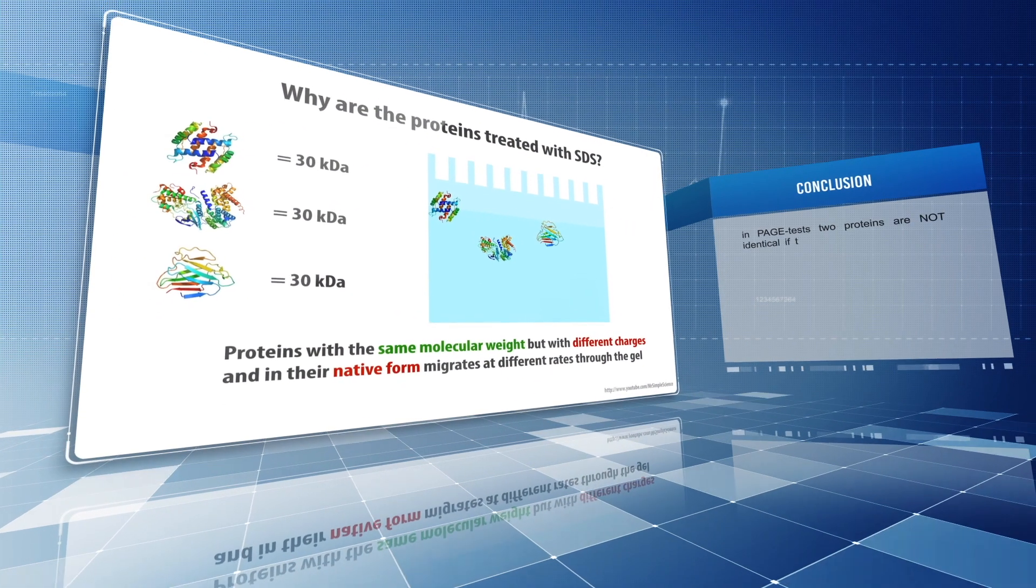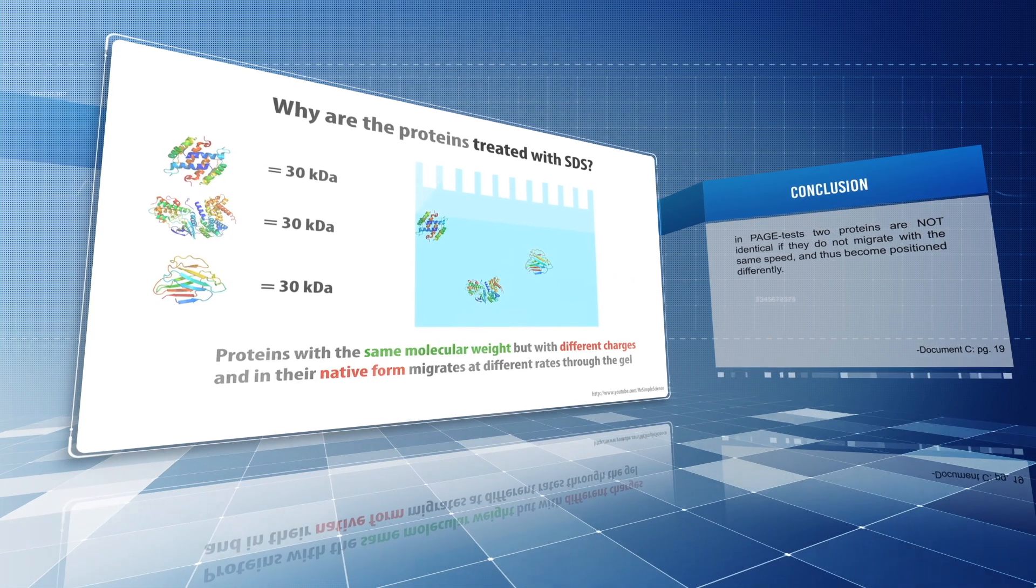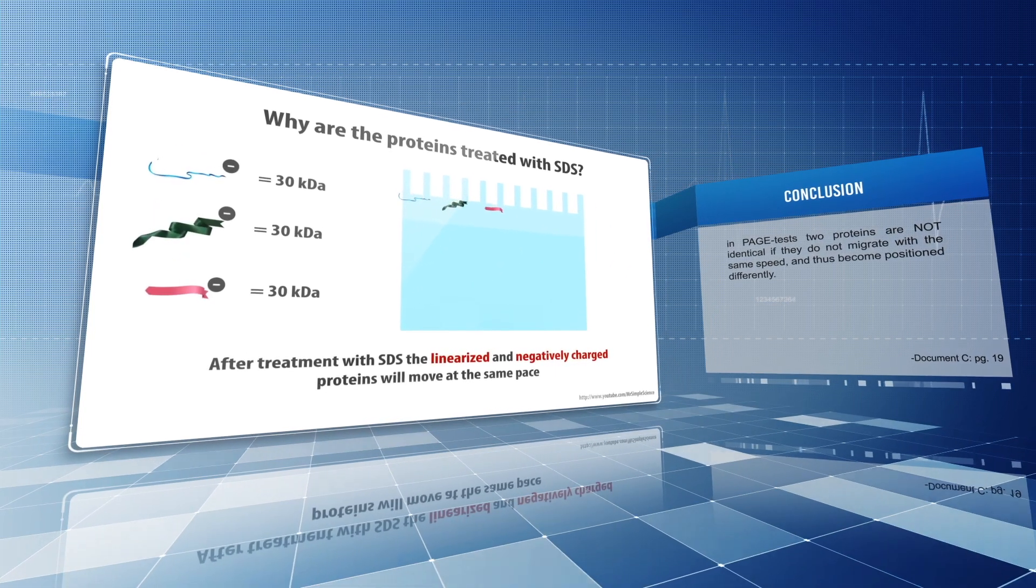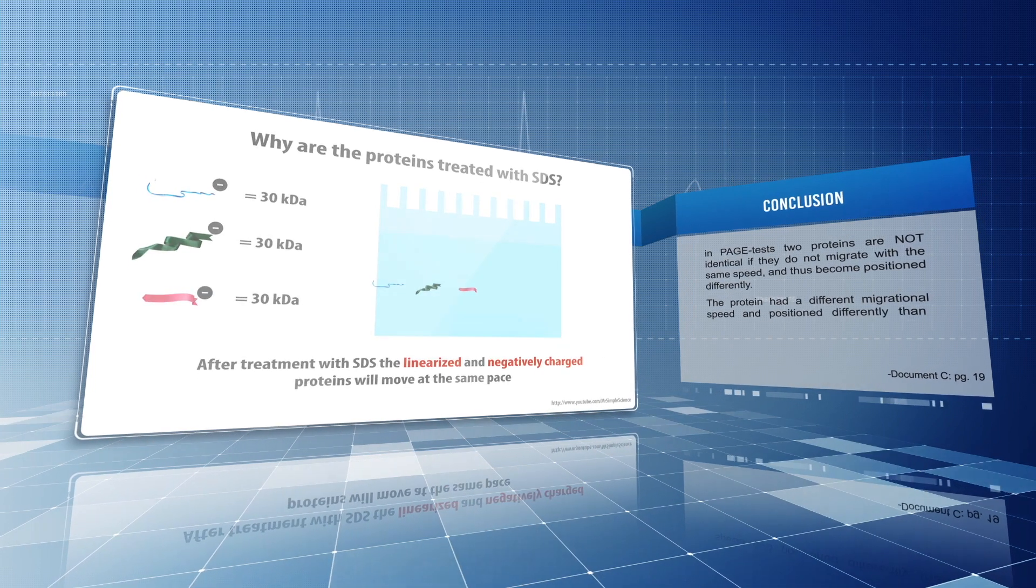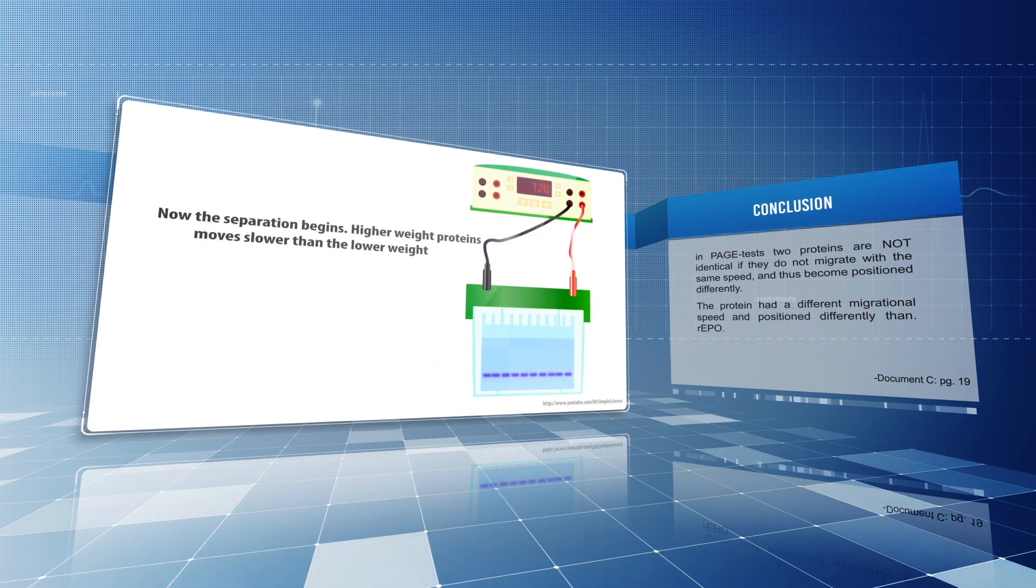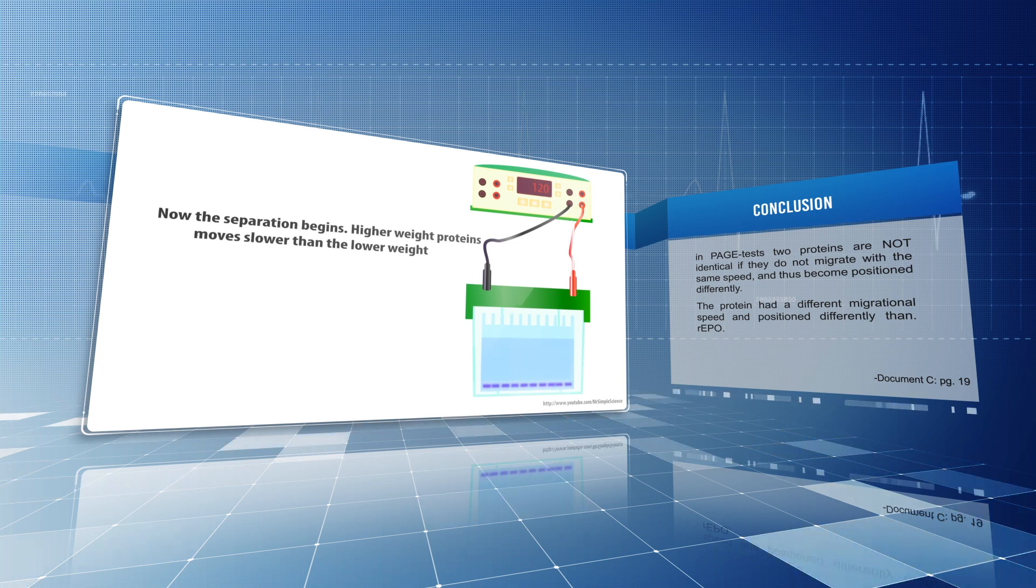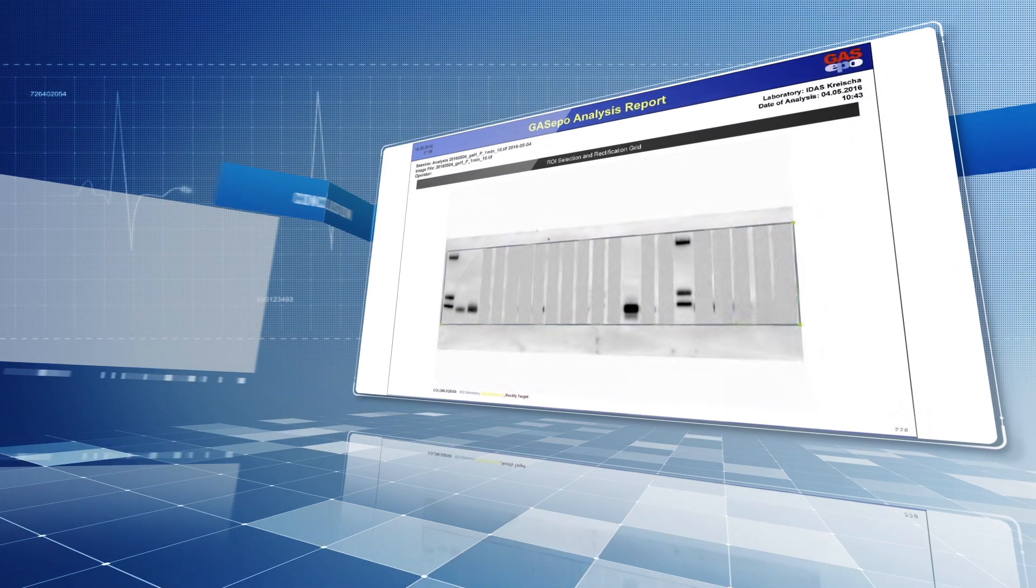Two proteins are not identical if they do not migrate with the same speed and thus positioned differently. The protein that the laboratory claims is R-EPO has not been positively identified. That is possibly due to the tailing or spreading of natural E-EPO, which is typical and can be seen from other negative controls.